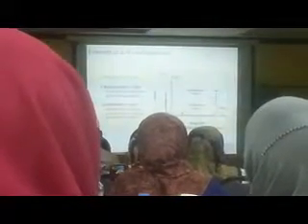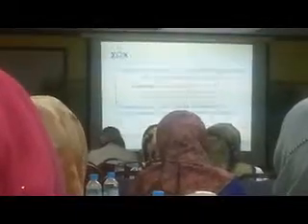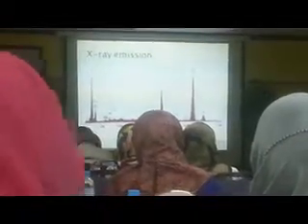The continuous X-rays, they don't give much information. But characteristic X-rays, they give some information because of the peak position on the x-axis. This is a typical EDX pattern.